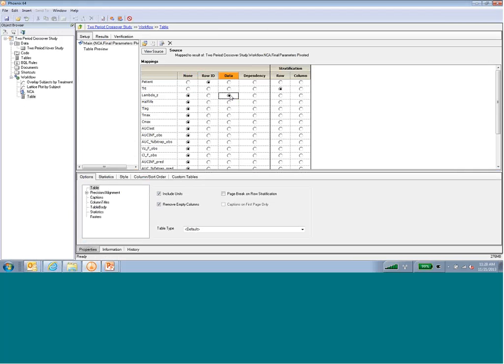And then the data output will be a PK parameter that I want listed and summarized in the table. So let's choose some commonly used parameters such as the lambda z half-life, Tmax, Cmax, AUClast, AUCinf, volume, and clearance. So these will be the data variables in the table.